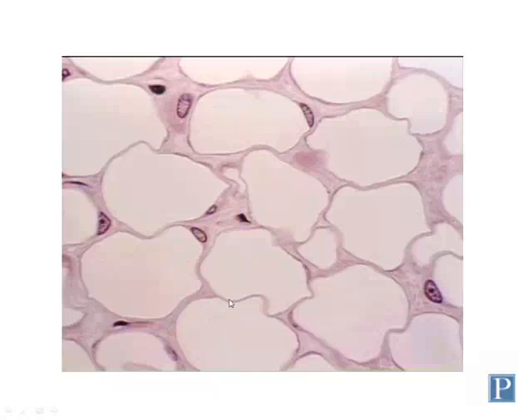This is tissue that has not been stained with the OsO4. This is adipose tissue still, and you can see a lot more in the matrix a little bit better because there's a lack of osmium tetroxide. Notice that the alcohol wash of the H&E tends to remove some of the lipids within the cells, causing them to have this kind of shriveled up appearance. They kind of collapse on themselves just a little bit. So that's an artifact of preparation from dehydrating this tissue with the alcohol.